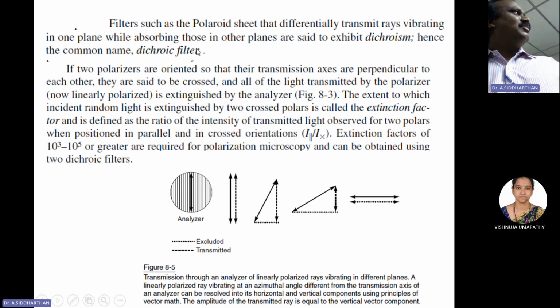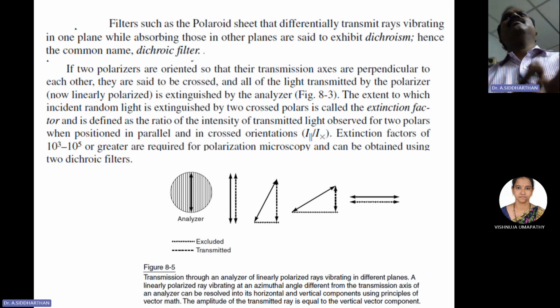So polarization may occur by reflection, and both possibilities are there. If the material reflects, polarization may happen. In some cases, when it is refracting also, polarization may happen. It all depends on something called the axis. On a certain crystallographic plane, in a certain direction, we find a ray is accelerated, and some ray is decelerated.